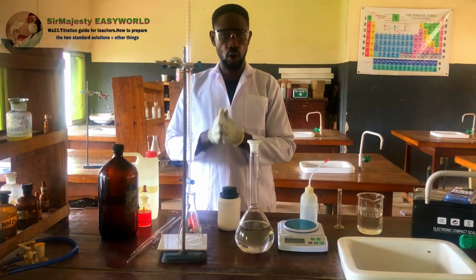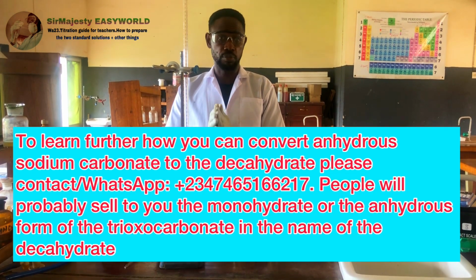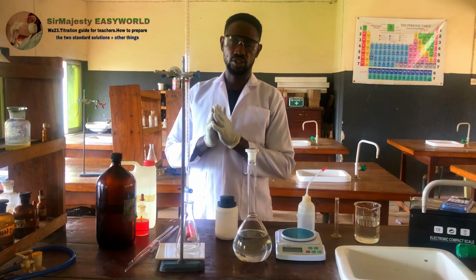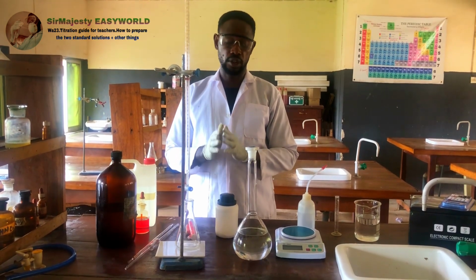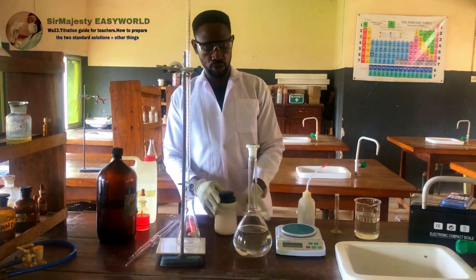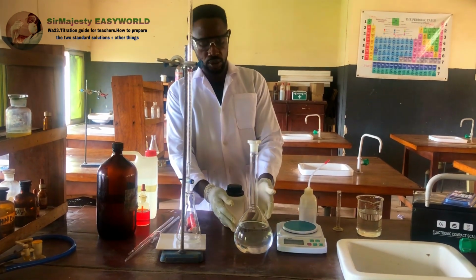So the first error comes from you getting the wrong decahydrate, and I've told you what to do to get it by yourself. I've finished preparing the decahydrate. You are required to measure 5 grams of the sodium carbonate decahydrate, which is expected to be contained in 1 dm cube of the solution. So what you need to do is use your weighing balance, measure 5 grams as instructed, then dissolve in this volume.